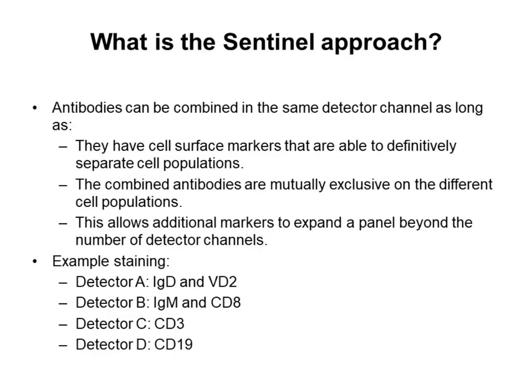So what is the Sentinel approach? This is something we have been using in previous years. Practically, it is the combination of different antibodies into the same detector. And you can do this if and only if the markers of interest are expressed on different cell types. They are mutually exclusive, and you're sure they are not going to be regulated by activation, for example.